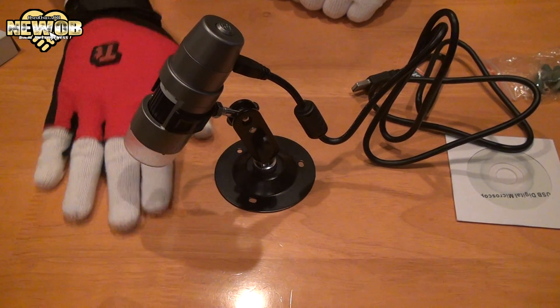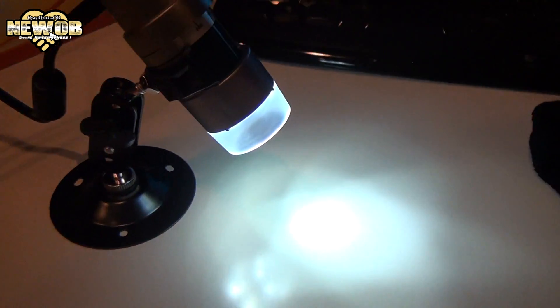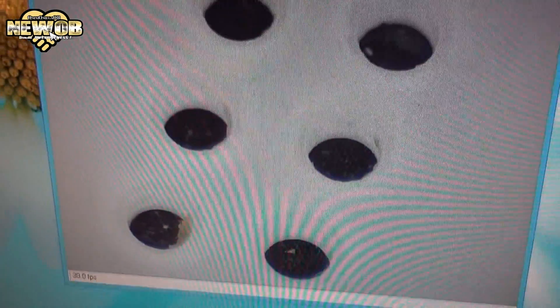You can put all kinds of things underneath and see what they look like. There is a light on it. Zoomed up, there is some dirt on my PlayStation Vita — it's actually pretty disgusting and dirty. At maybe 75 times zoom on the glass of the Vita, you can see some scratches. On the four direction buttons you can see dirt in between them. Wow, it's quite dirty — unbelievable. These are things you don't even see; it looks so clean when you look at it normally, but it's actually very dirty. This is the cartridge of the PlayStation Vita.